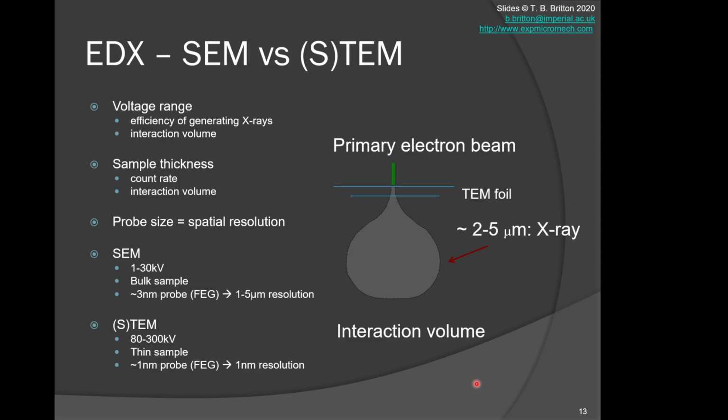So the assumptions that I've shown you before are broadly consistent with something like an SEM-type volume, where you have a large volume of scattering, so the electron beam can scatter from a large volume, and the characteristic X-rays will be generated from those. This volume is, of course, dependent on the energy of the primary voltage, because primary electrons of higher voltage can penetrate further into the sample.